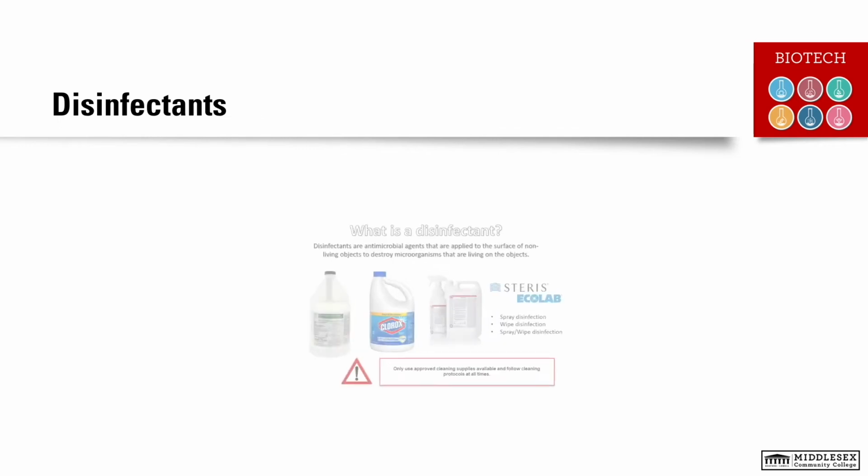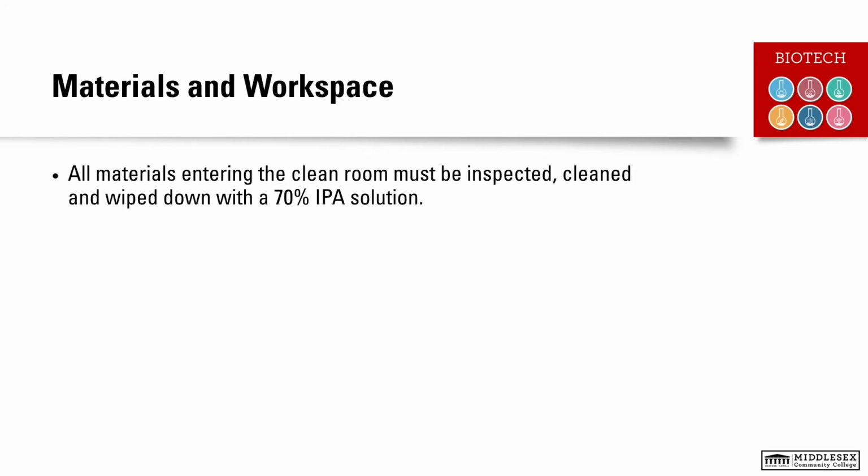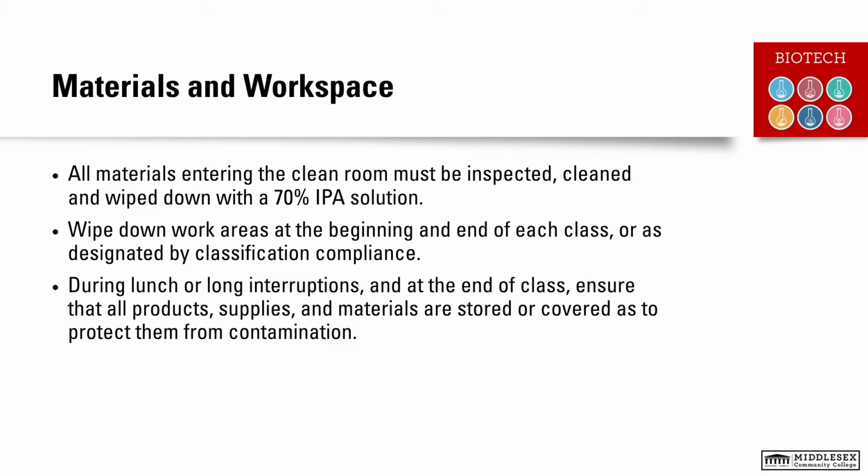When using disinfectants, you should reference the cleaning protocol. All materials entering the clean room must be inspected, cleaned, and wiped down with a 70% IPA solution. Wipe down work areas at the beginning and end of each class or as designated by classification compliance.